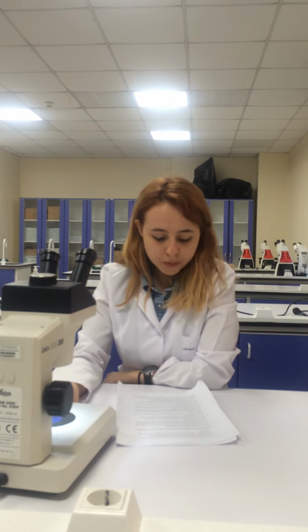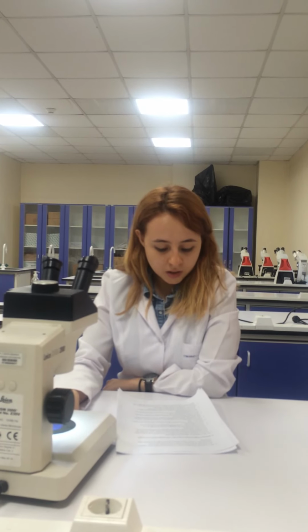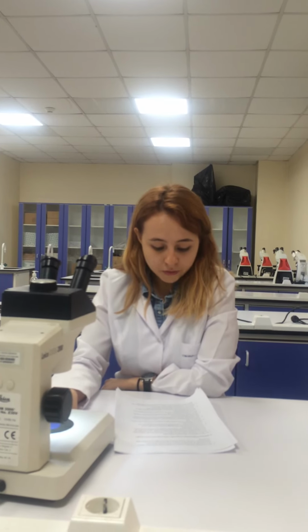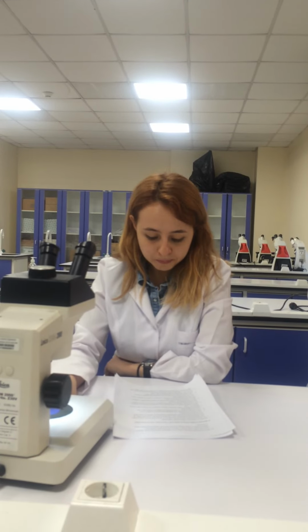The 60% propylene glycol is removed and then the plate is washed twice with double distilled water. 10% formalin solution is added back. The stained lipid droplets inside the adipocytes are observed by light microscope.